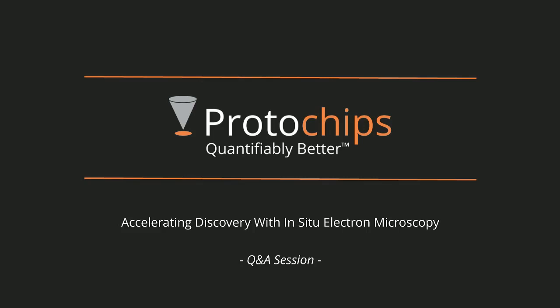Okay. Another question just came in from someone who says he works on polymeric nanofibers, and the question is, how do you load such a delicate sample onto a very small holder?